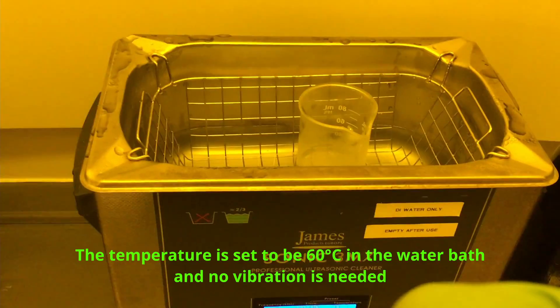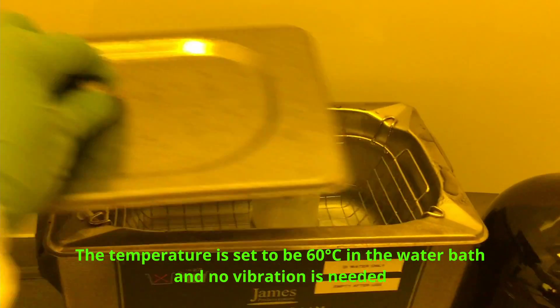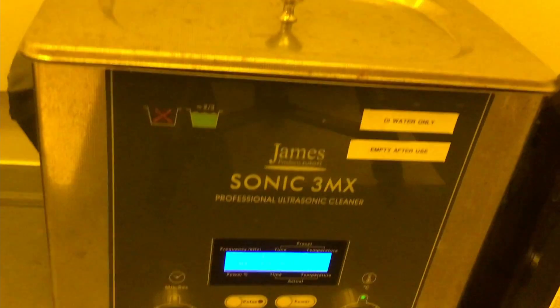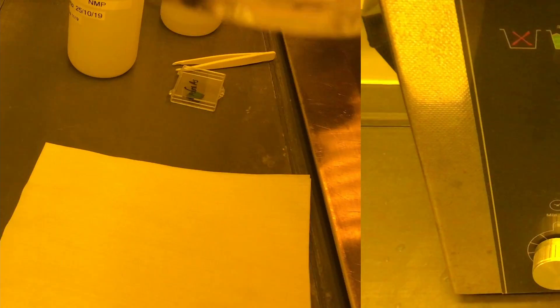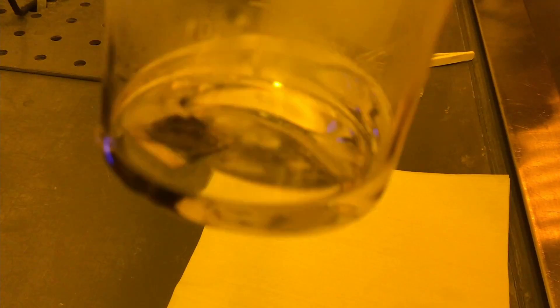Put the sample into a beaker and place the beaker in hot water at 60 degrees Celsius. After 5 minutes, take the beaker out. It can be seen that some gold has been peeled off.